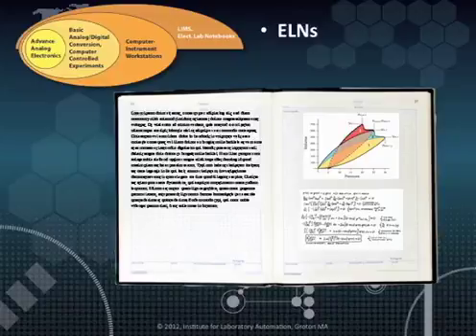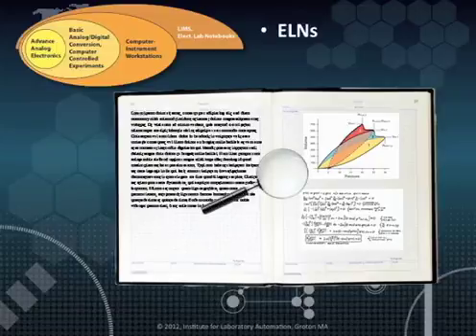This dual signature arrangement is important because it establishes the timing and authenticity of laboratory work that may be used as part of corporate intellectual property. It may find its way into the patent filings, new drug applications, or as test results in support of research projects. The limitations of paper notebooks include the fact that it is on paper and as a result easily damaged by moisture, mold, or other mishaps. It's also difficult to search. Even digital copies suffer from the fact that you have images of someone's handwriting that can be hard to interpret.